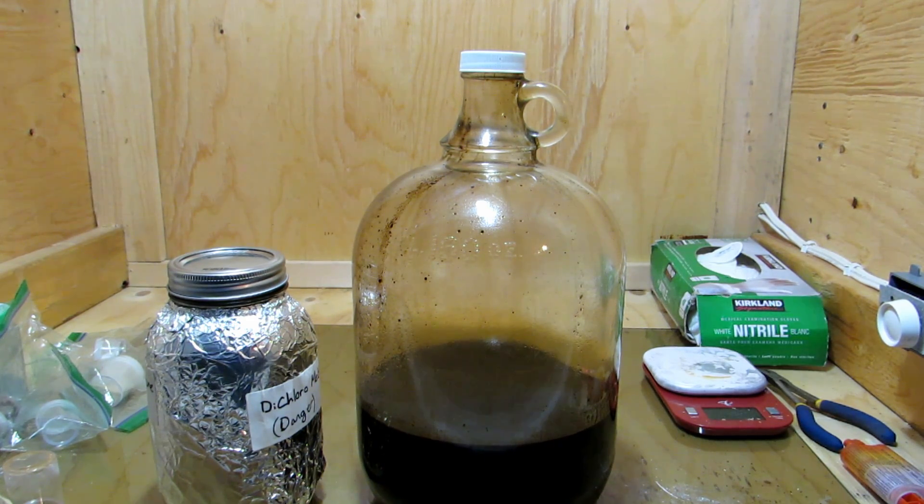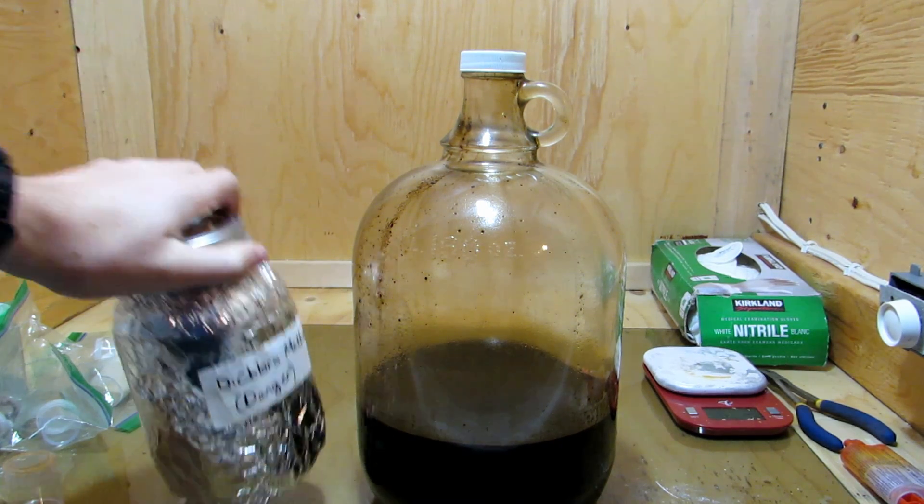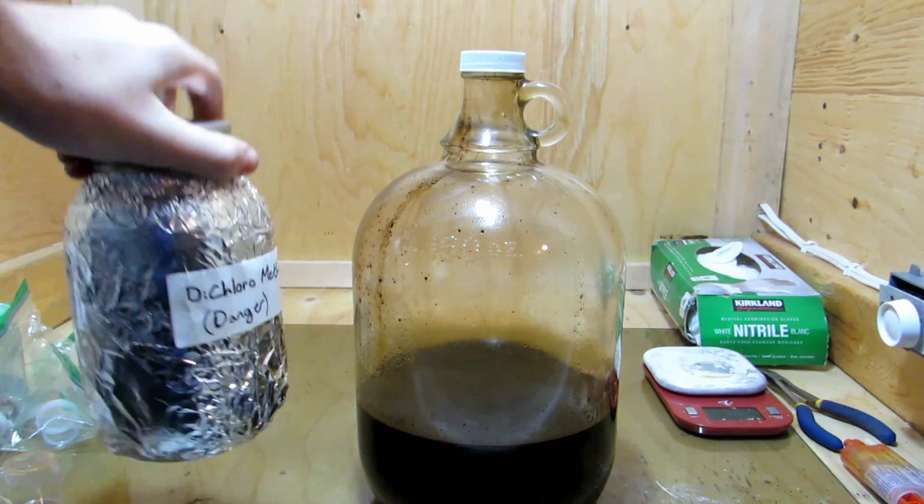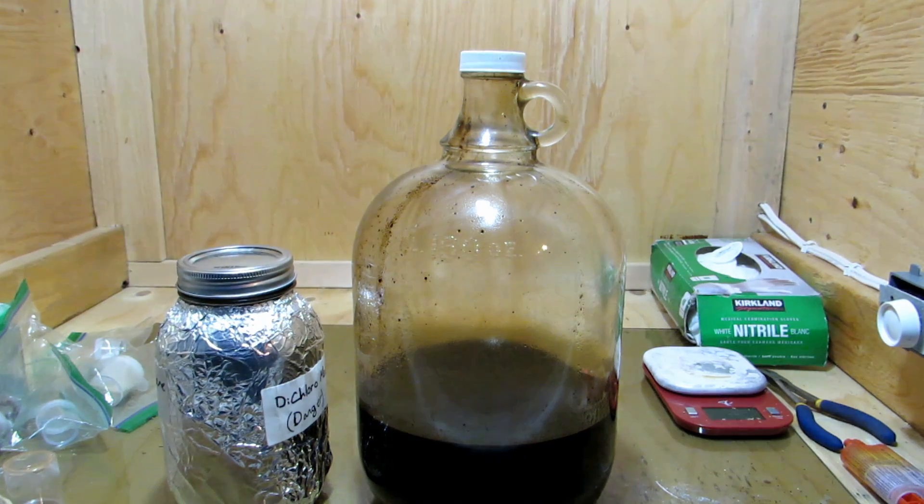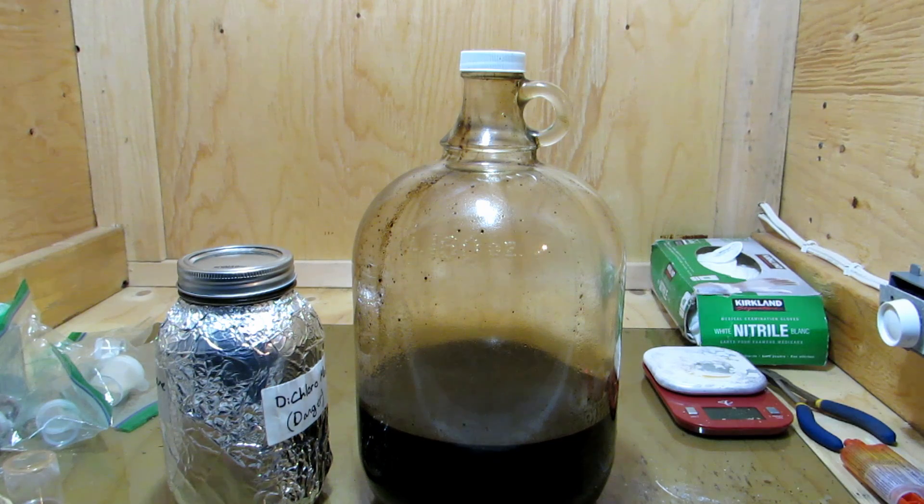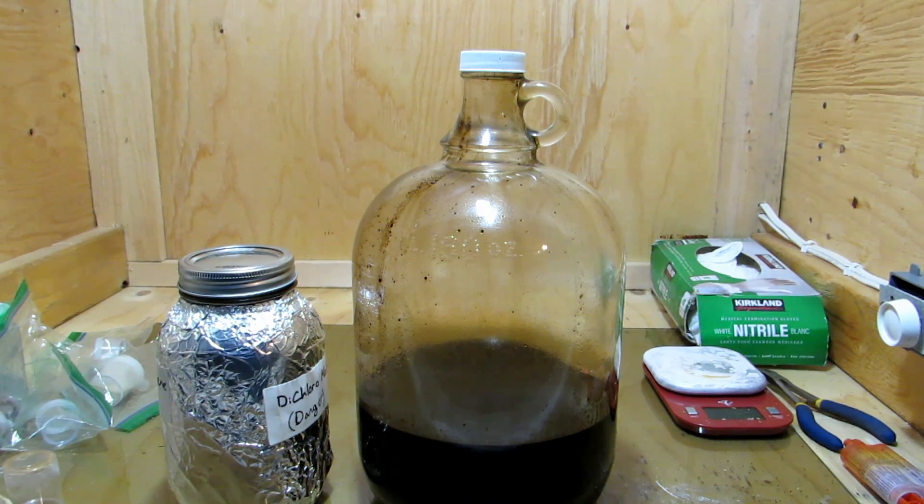To extract our caffeine, we're actually using this dichloromethane here, which is what we produced in a previous video. We distilled it from varnish remover. I believe we have about 800 milliliters in there, and we're going to be using all of it. Of course we can recover it, so it's not like we're wasting any.